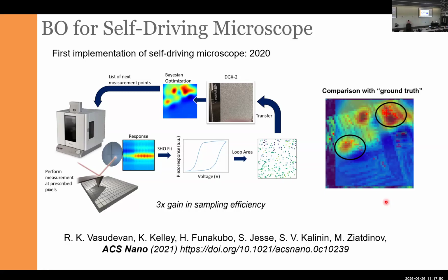So in all cases where we tried to develop an algorithm and deploy it on the instrument, immediately we had to go back and build the digital twin, because we spent a lot of time and money not understanding what goes on. In all cases, when we first built the digital twin, things worked more often rather than not, and the simulation results were a big part of the hyperparameter tuning.